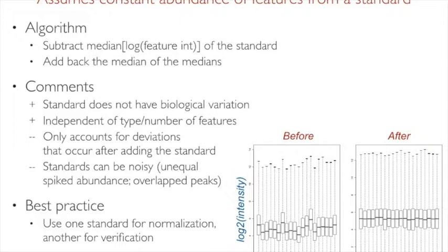Some people say, how about an endogenous protein standard, which we know is not regulated at all? From what I hear, no such protein exists, that we know no matter what we do to the sample, is always constant. I don't know, maybe you know of one. I've never seen one. So it's tricky, finding a standard which really reflects everything you want. Plus, if we spike synthetic standards, you have to have a good hand and make sure it's constant. So there are all of these challenges that you need to deal with.